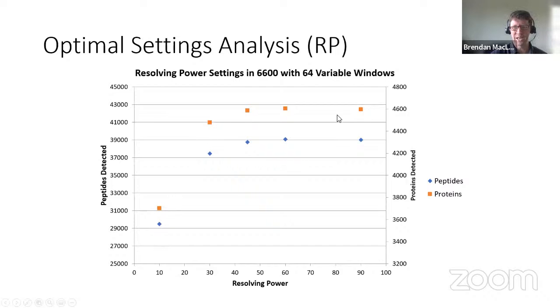And there was no way I was going to do it manually. So Skyline already had a command line interface, and I wrote these batch scripts that allowed me to go to bed and come back and fill out a spreadsheet that could allow me to see this graph and see that, well, actually it's still getting better up to about 60,000.